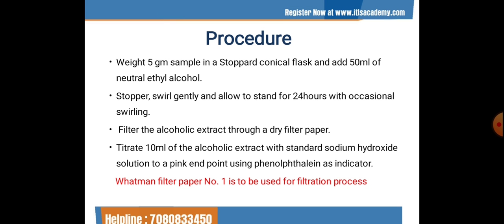A color indicator changes its color as soon as all the substance contained in the sample has reacted with the titrant added. The concentration of the substance contained in the sample can then be calculated based on the volume of the titrant which was required until all the substance had reacted. And here the indicator we are using is the phenolphthalein indicator, which generates the color, and the amount of titrant used here is then noted down and calculated.